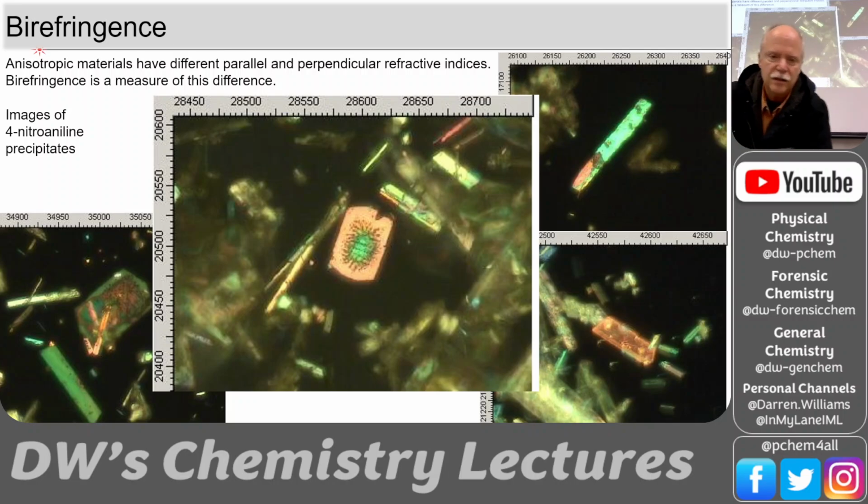So this is a crystal that was precipitated. It's an organic substance, nitroaniline. It was dissolved in like DMSO or N-methylpyrrolidone. And then from there, it was put into, I think these are methanol, and then from methanol to water. So it crash precipitated out in water from methanol, from NMP. And I was trying to see if the intermediate solvent made a difference, and it did. So it was a successful project.